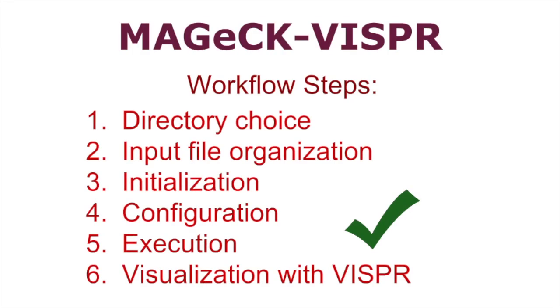You now know how to harness the MAGeCK-VISPR workflow to turn raw CRISPR-Cas9 screening data into interactive visualizations of results and quality control data. For more information on MAGeCK-VISPR, Snakemake, design matrices, or anything else in this video, please visit the links in the video description below.